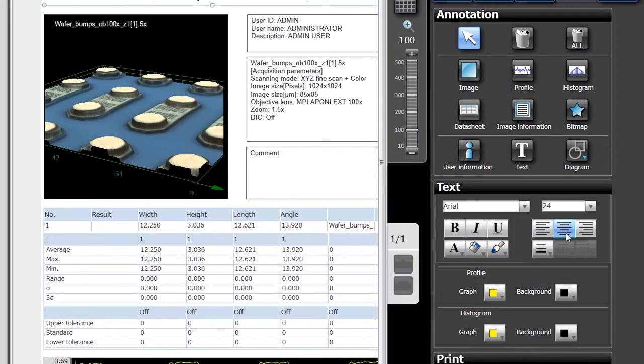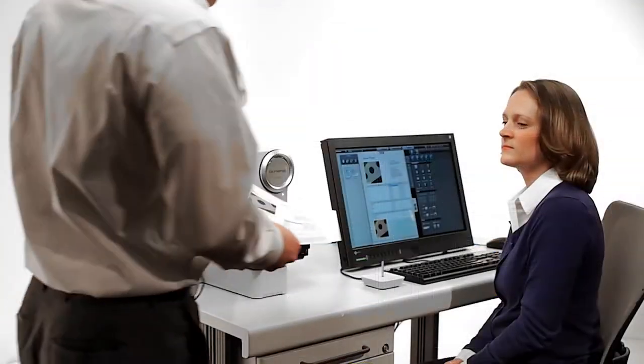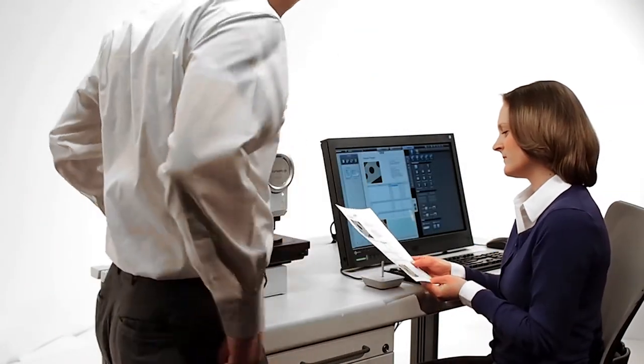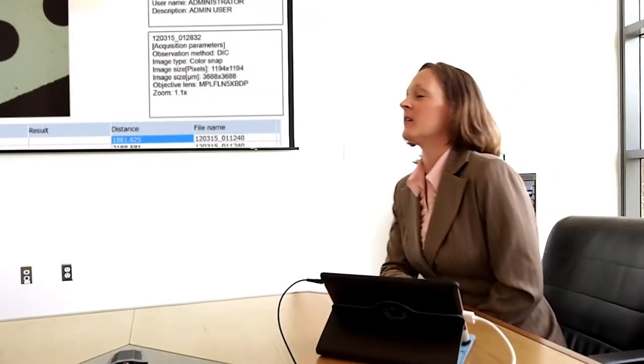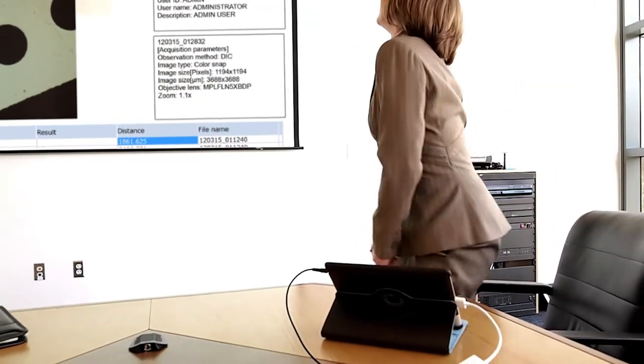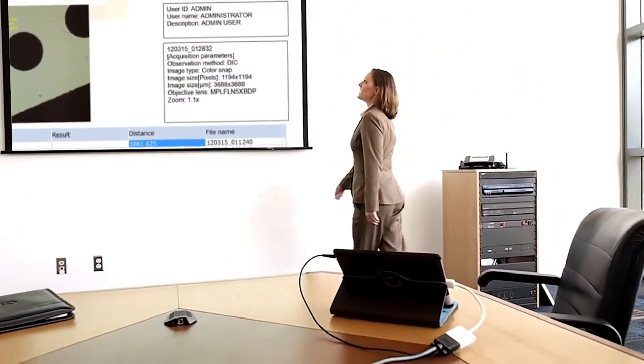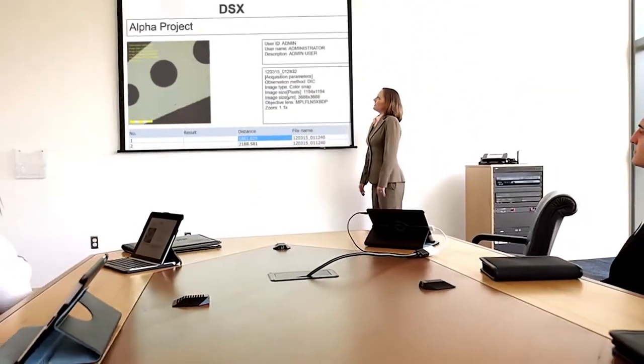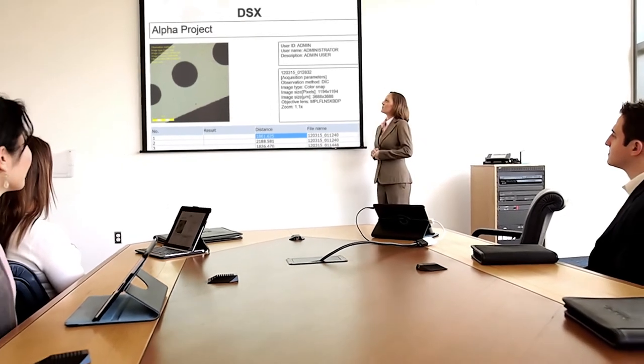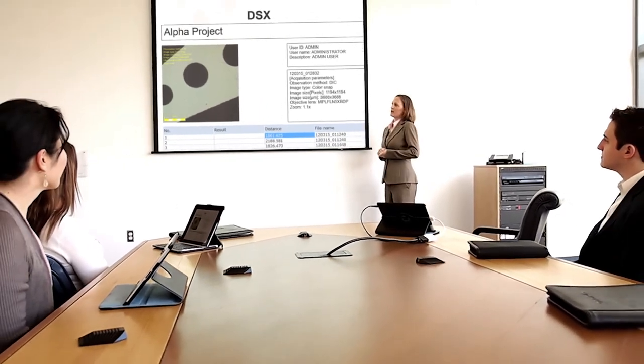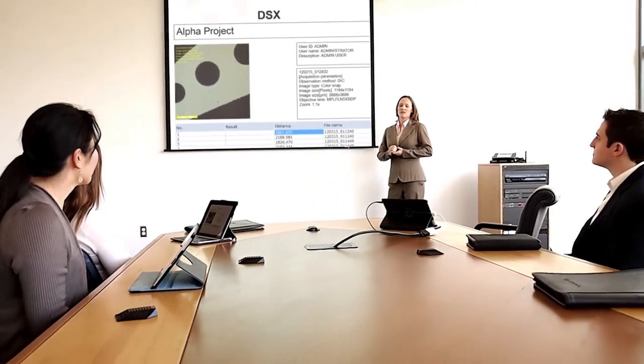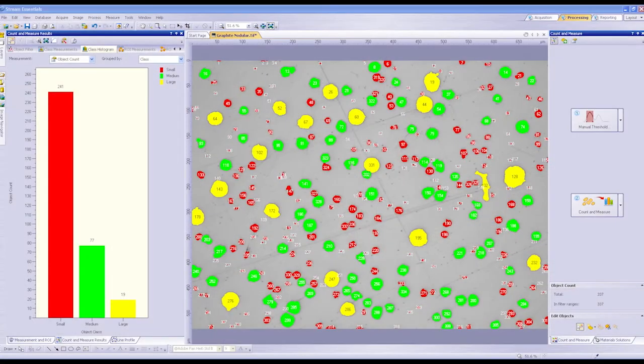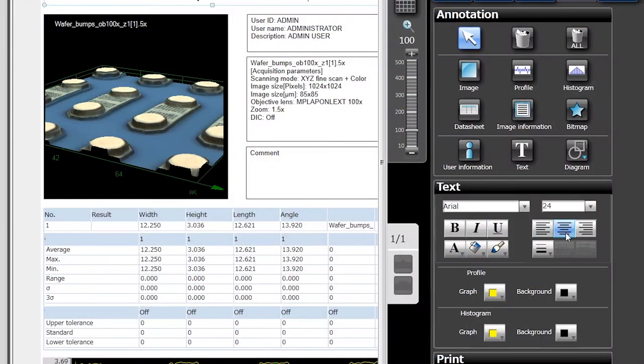The one-click DSX report function provides results using most common output formats. You can set up reports to generate automatically. Like almost all Olympus industrial microscopy systems, DSX is compatible with powerful Stream image processing software for measurement, analysis, and reporting.